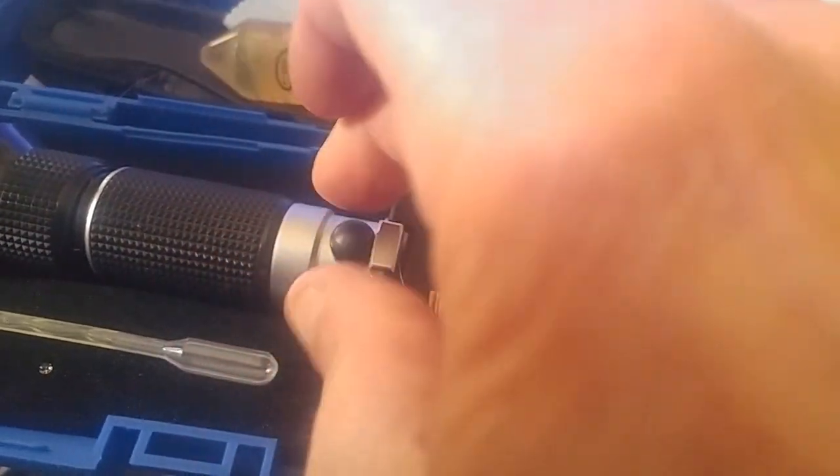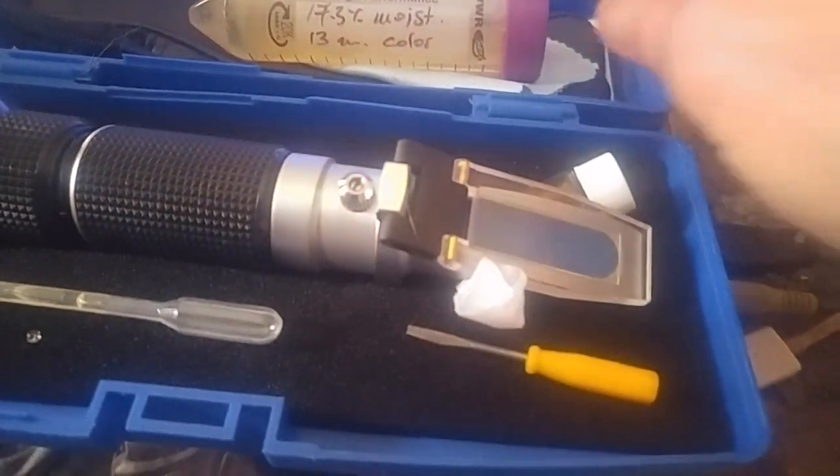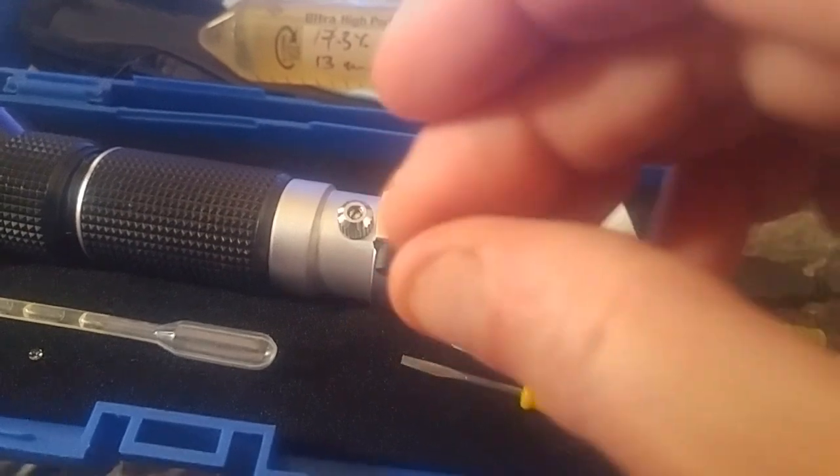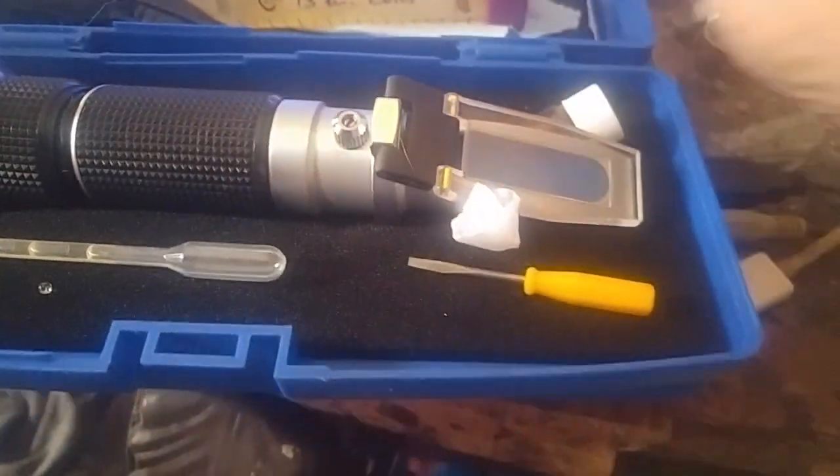It comes with these two things. All you do is pop this little rubber lid off and there's a screw right there. You unloosen the screw and then you turn that back and forth — that's if you have to calibrate it.